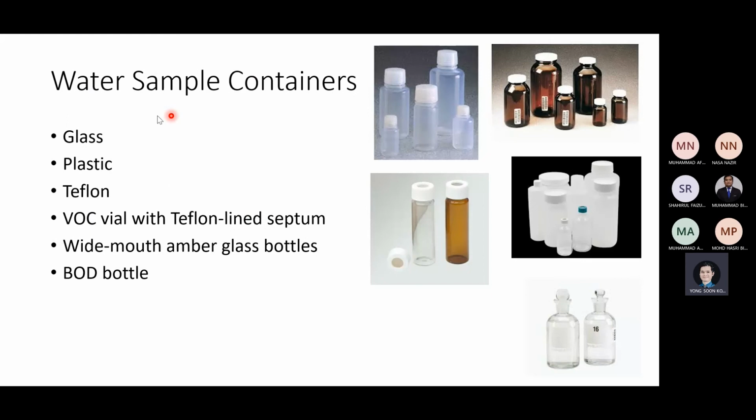which is why we are here talking about the containers. So you have various types of containers. Like I said, this is a septum, yeah. And why do we even use this one, especially the one with the amber bottle? Because this is a vial, and they are usually filled with water samples that we want to analyze for organic content, pesticides for example, because pesticides degrade very fast under very strong sunlight.